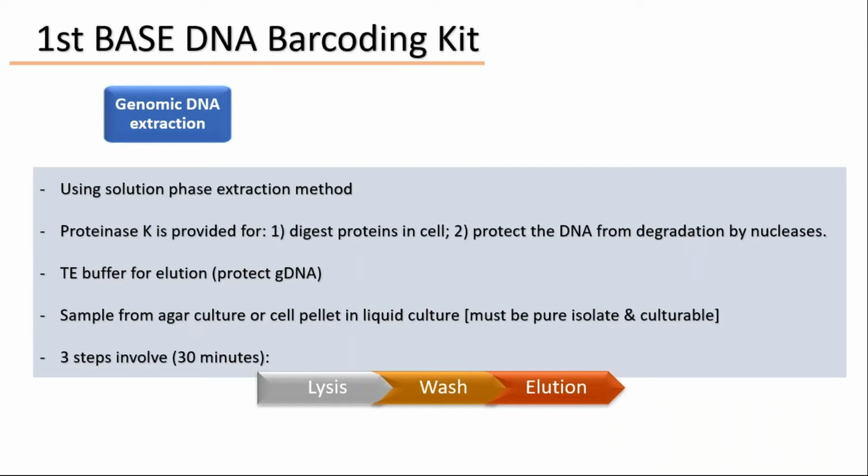Okay, and for the TE buffer that we have ready in the kit, the function of the TE actually is to protect our gDNA from degradation for long-term storage. And another important point that I would like to highlight is that the sample used for the gDNA extraction must be a pure isolate cultured on an agar culture, or either the cell pellet from a liquid culture.